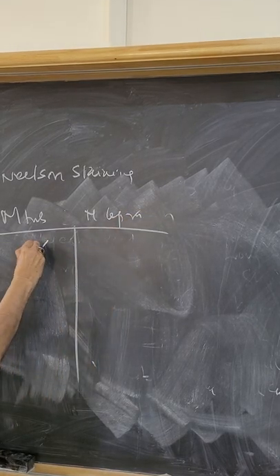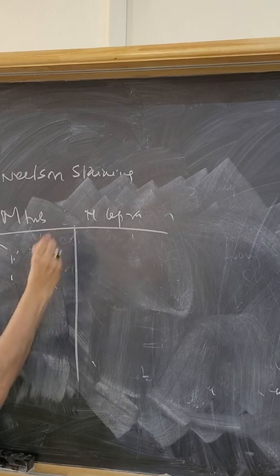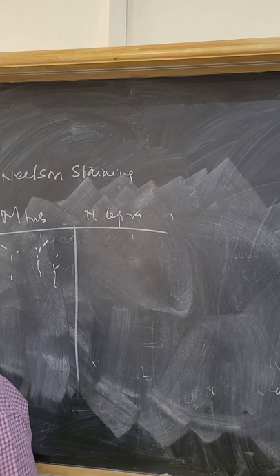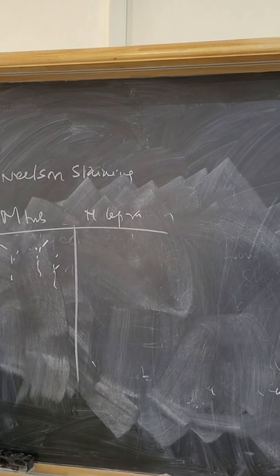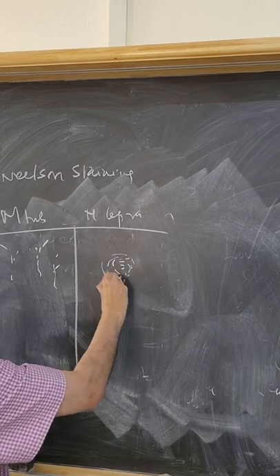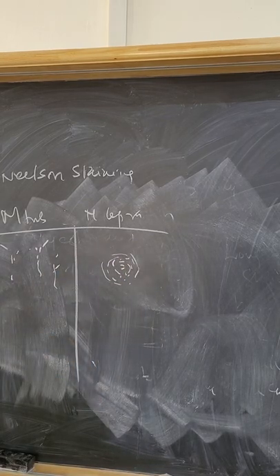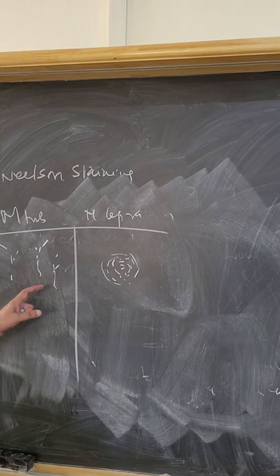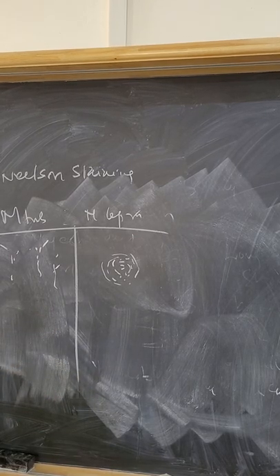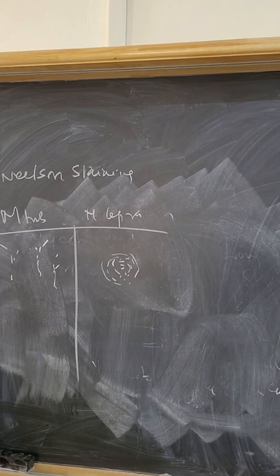This one is long, slender, slightly curved, with a beaded appearance. This one is short, stumpy, looks like a cigar bundle. Remember Amitabh Bachchan and Jaya Bahaduri. Tuberculosis is Amitabh Bachchan. Mycobacterium leprae is Jaya Bahaduri.